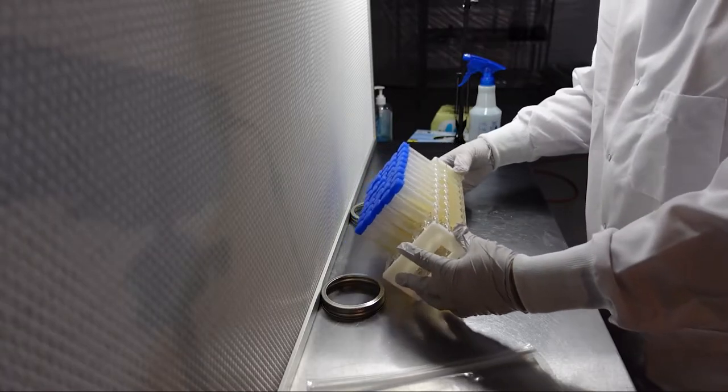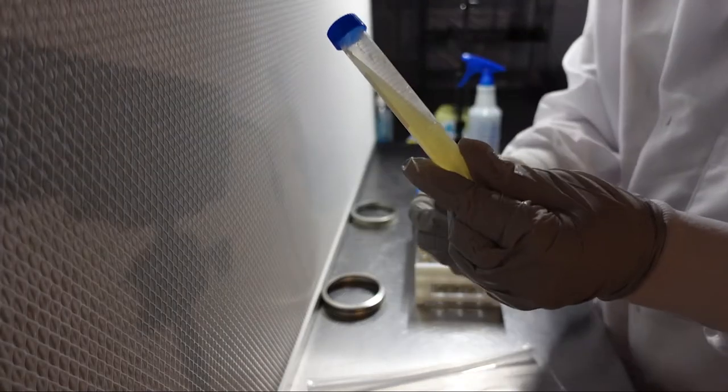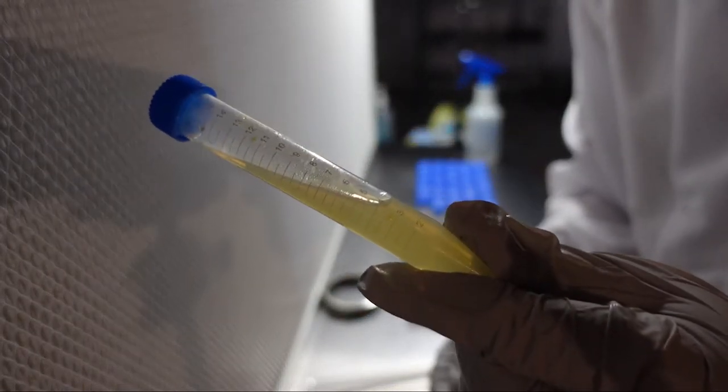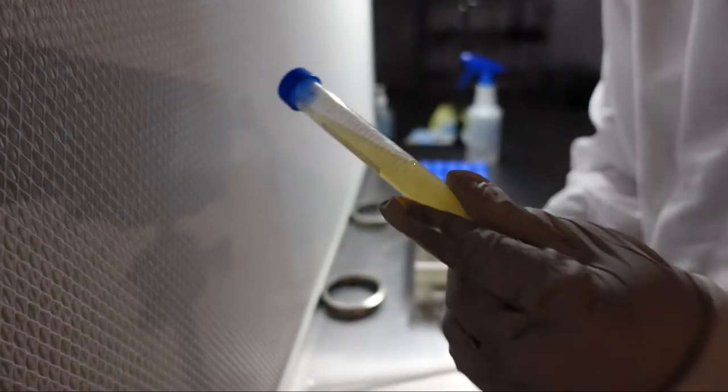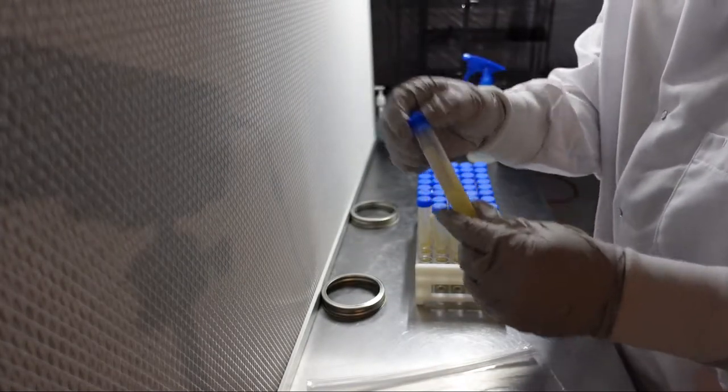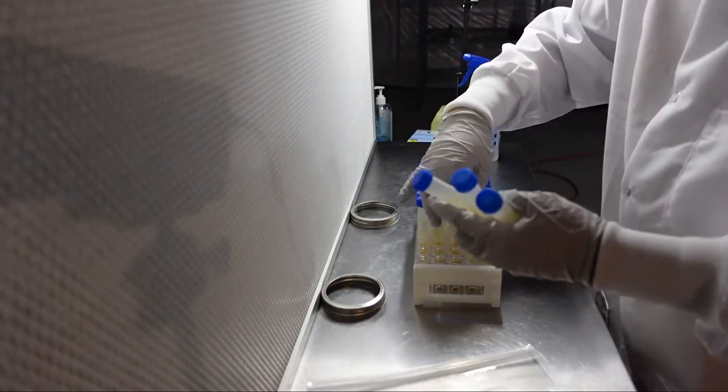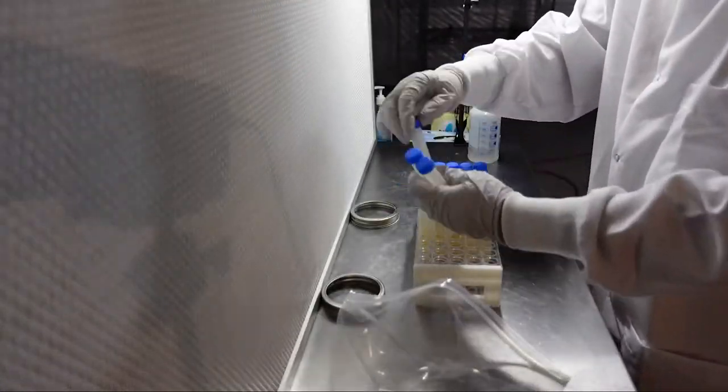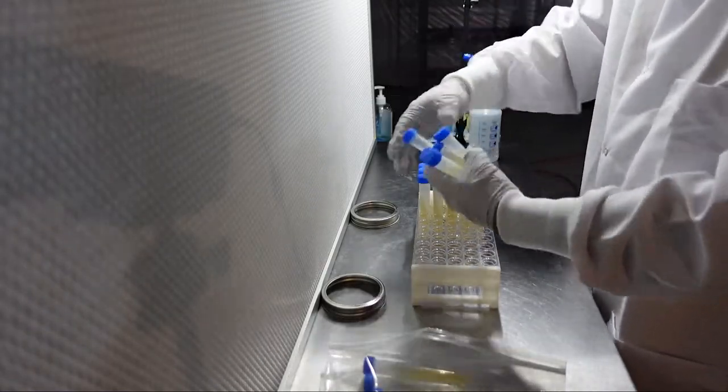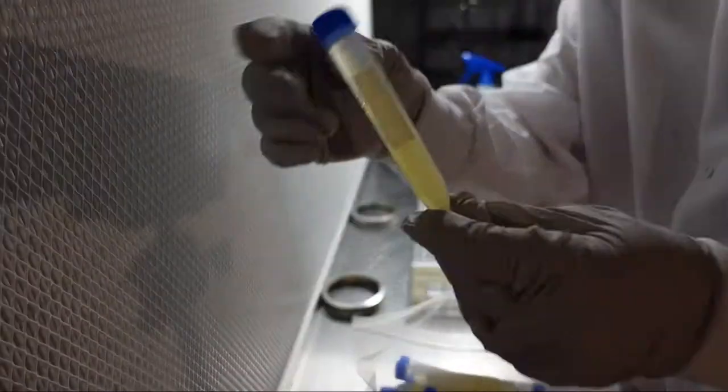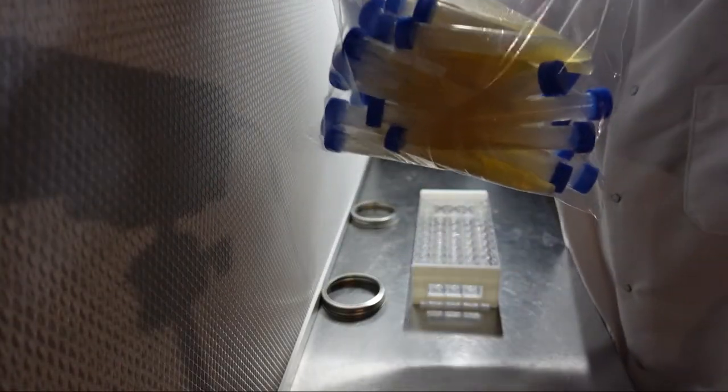Let the media cool completely in this position. When it's completely cool, you can tip your rack back over and you'll see you have nice slants with a lot of surface area for your mycelium to grow on. Now tighten all of the lids completely to keep out contamination and to keep your slants from drying out. And then place them in their original packaging or a plastic ziplock bag until you're ready to use them. You can prepare a bunch of these ahead of time and store them for months before use.